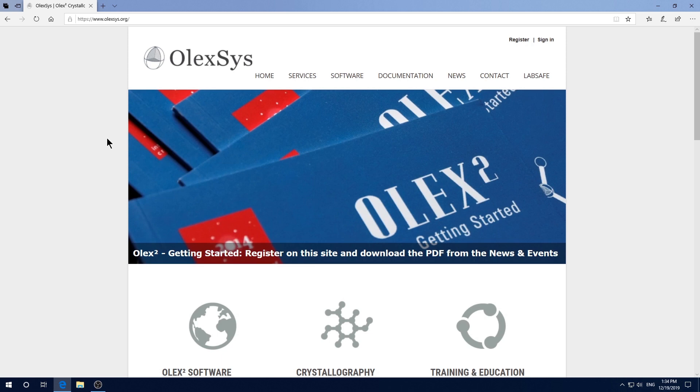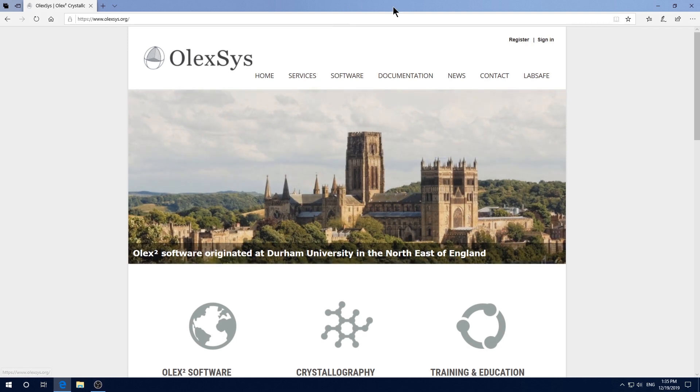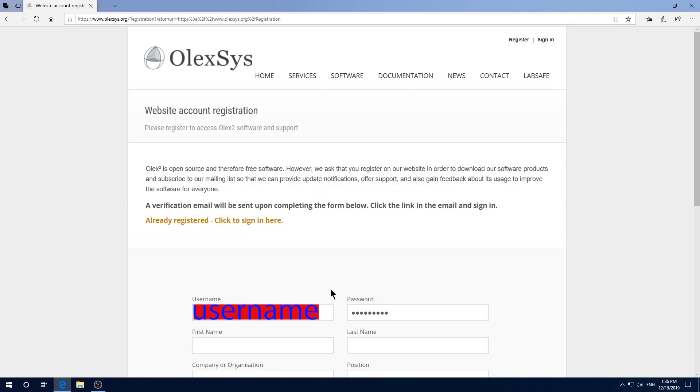After all, the author has put in so much time to develop it. And they only ask for the citation and recognition as a return. I do think they really deserve every bit of them. And they have done a wonderful job in developing it and keeping up with updates frequently. So you click register, type in the information to create account.